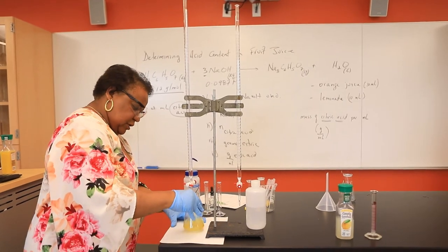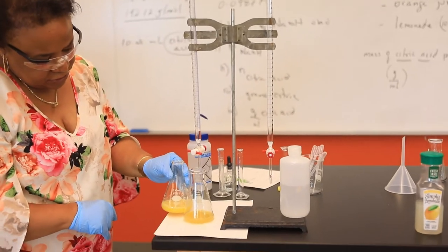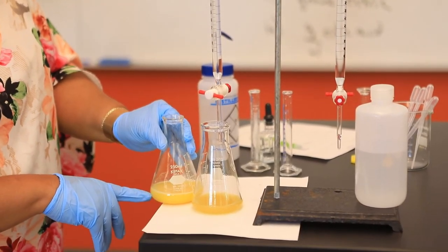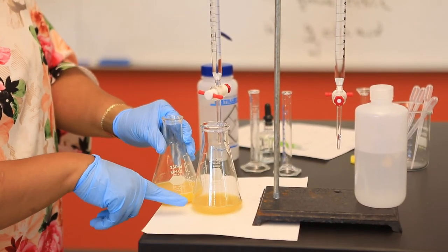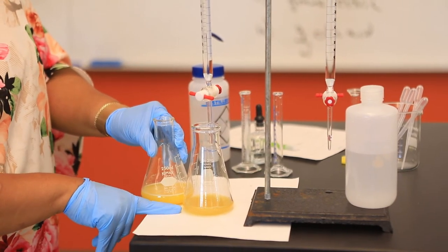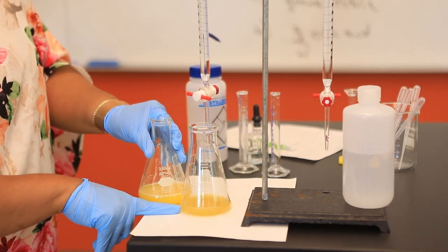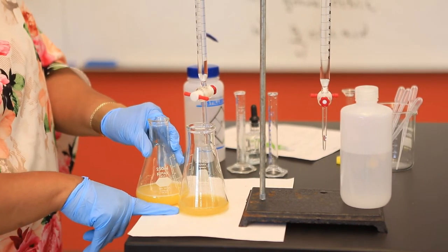Just for comparison, so that we're all aware that there is a color change. Here's my original sample of orange juice. You can now see, it's very challenging to note - you're not going to see that faint pink color because orange juice is yellow to start with. But you can certainly see that the solution is darker.